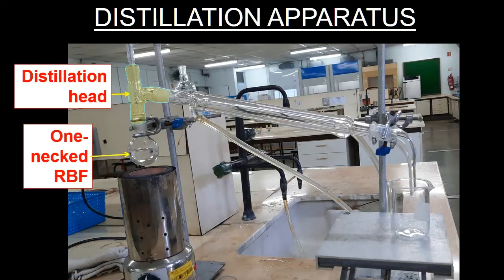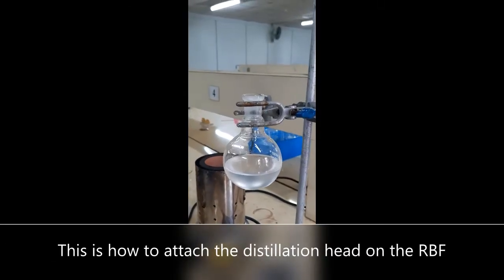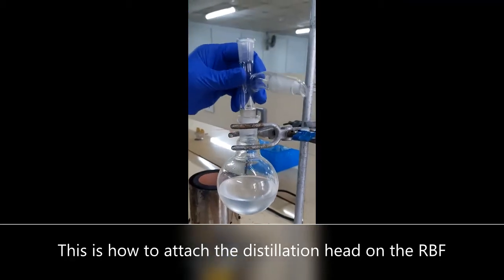Pay attention to the technique being shown, particularly the order of setting up a distillation process. It begins by clamping the round bottom flask and placing an adapter over it as shown in yellow. This is how the adapter is placed on the round bottom flask.